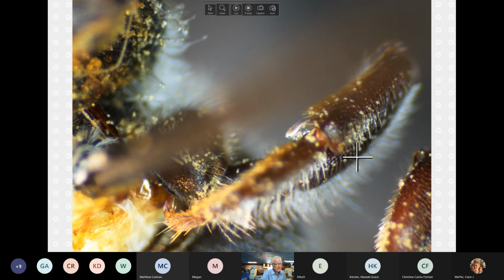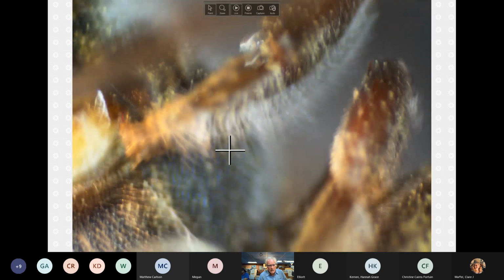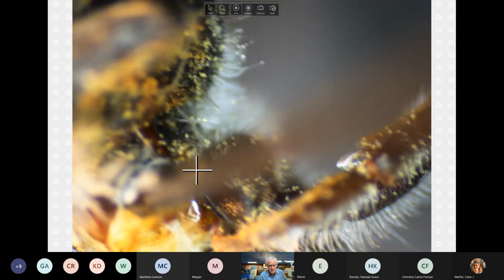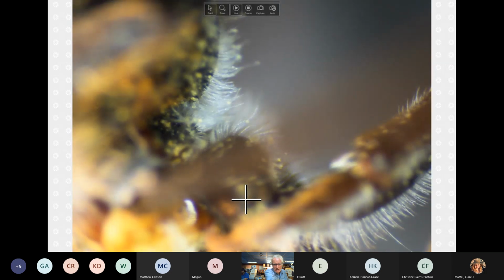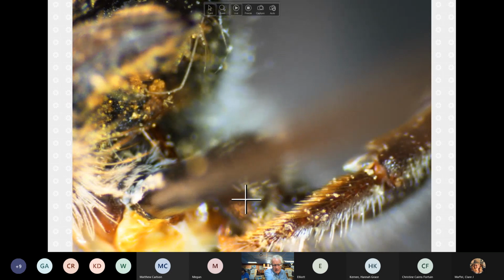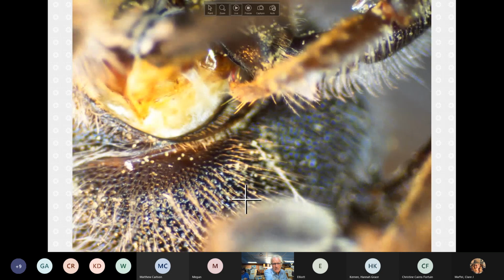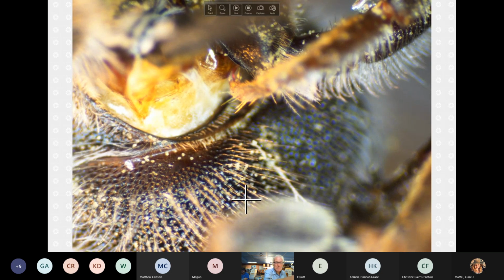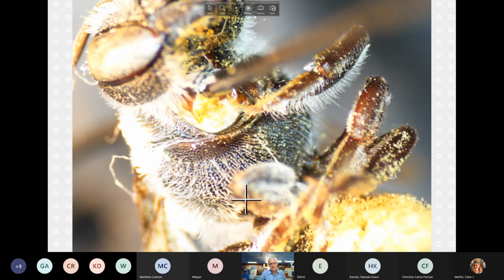And go back in here. Again, such a busy area, but when we look at this, yeah, you can't see any spine. That's the problem. The lack of the spine is much more problematic than seeing the spine itself. There's the pin. But I think the main point has been made that there is no obvious large spine coming out of the front coxa.